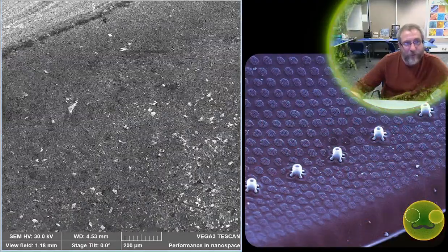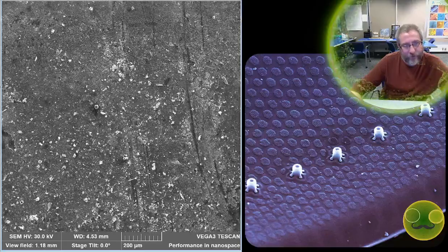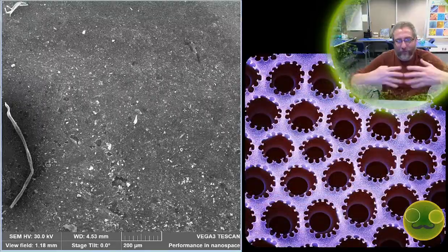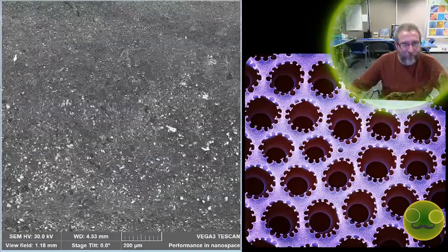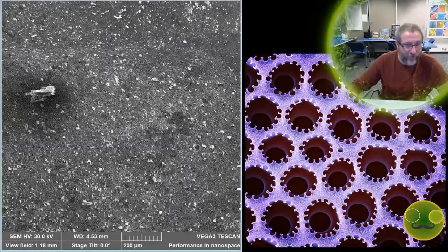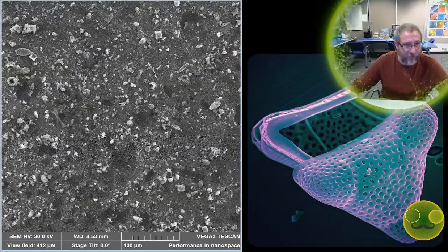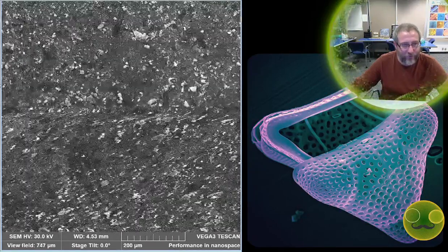Aulacoseira as a genus is a chain forming diatom, and they live in these colonies, and I sometimes like to wax a little poetic about them because they have these long spines that they use like fingers to join with the sibling cells that are adjacent to them. It's equivalent to holding hands with their sisters. Or daughters, I guess, if you want to think of it that way, because they're clones. But half of the parent gets added to the daughter. They add half of themselves to their offspring and then make a new one, right?